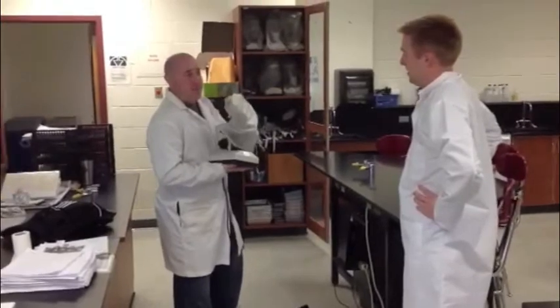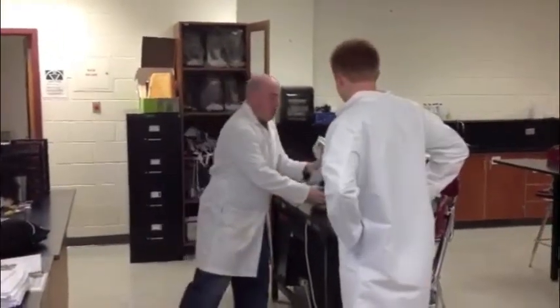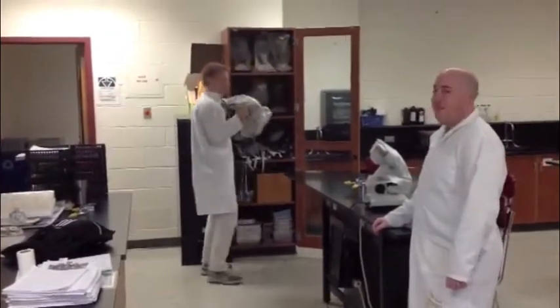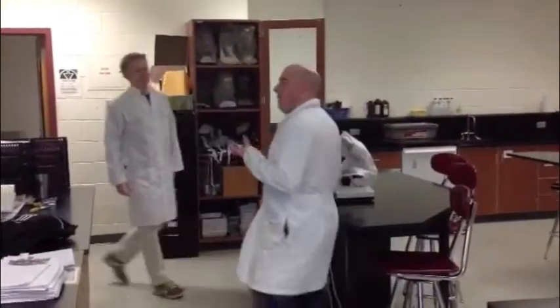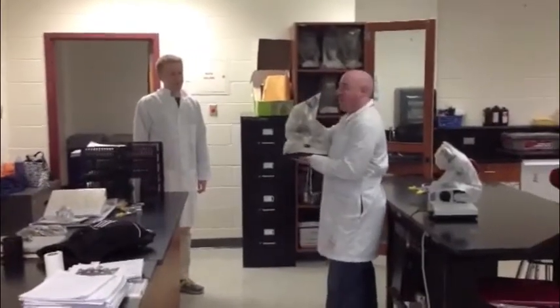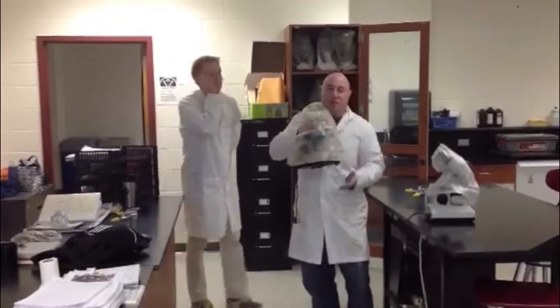These microscopes are pretty heavy. They weigh about 10 to 15 pounds each, and they're quite expensive. So if you don't carry it properly, you can damage it. You want to be really careful when you carry these things. You definitely want one hand on its arm and one hand underneath supporting its base. You also never want to grab it by the revolving nose piece up top.